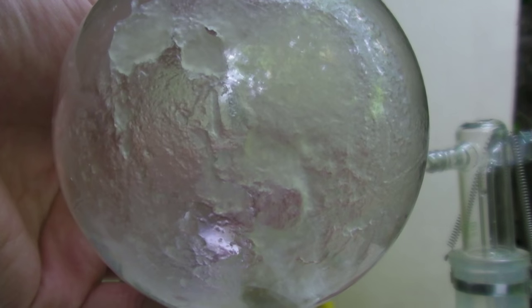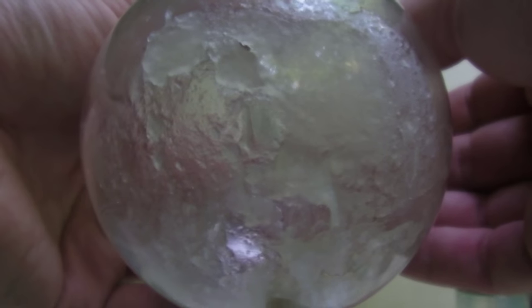After removing the distilling flask, the residue has solidified completely. Benzaldehyde easily oxidizes in air and usually contains benzoic acid. This can disturb reactions, and because of that it is removed by distillation.